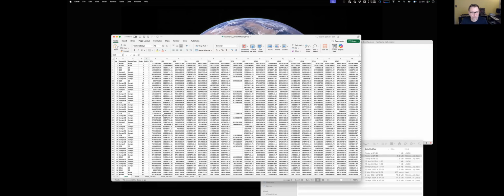Generally speaking, from the 20 years that I've been doing this kind of stuff with the pooled QC, this method is the best that you can do, is to pool a little bit of everything that you're using in your study and use that. Sorry, I kind of dodged the question, but it is a kind of suck it and see. We talk about this a bit more in the paper, so maybe go back and read the paper.